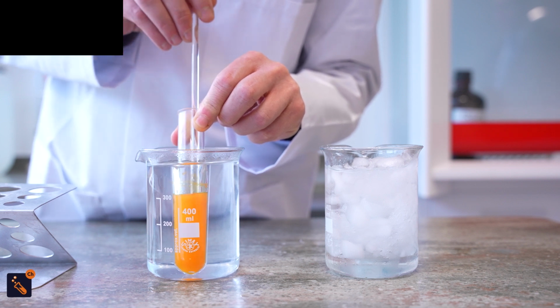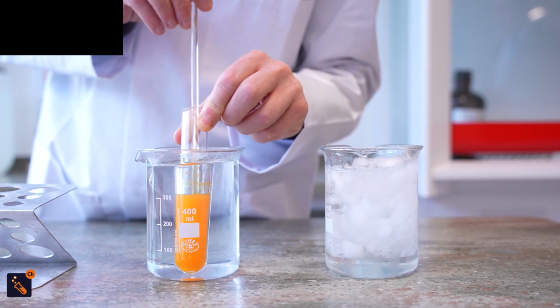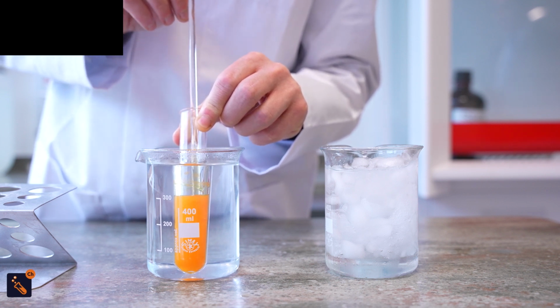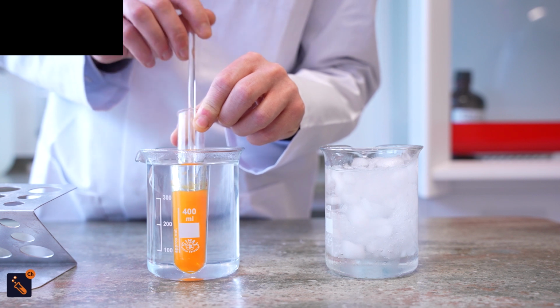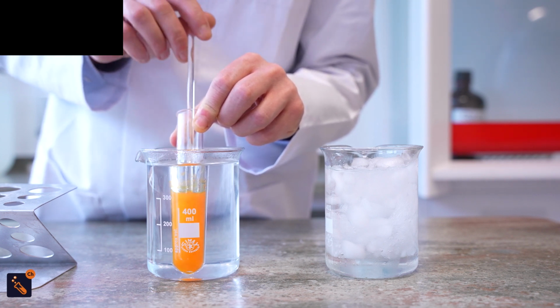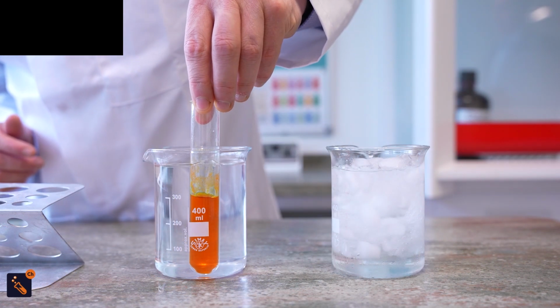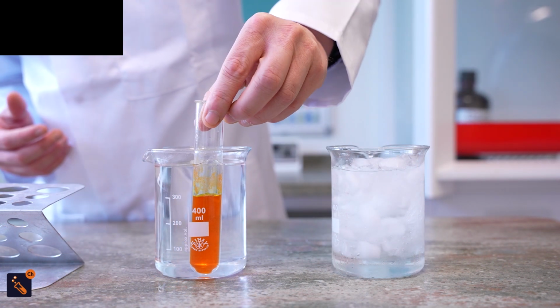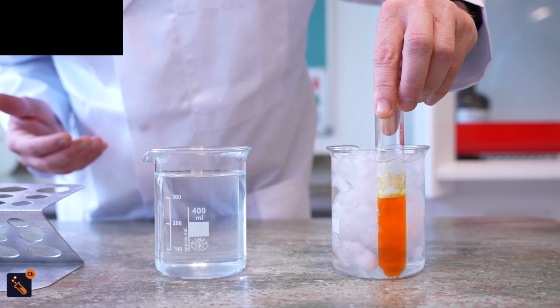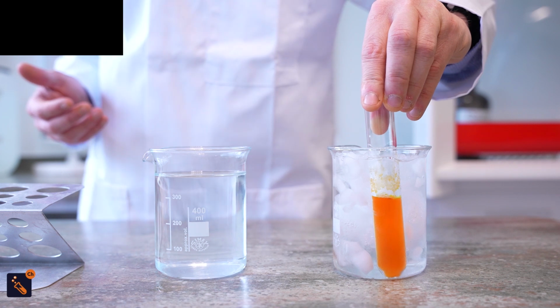As we stir it, the product will dissolve last because it doesn't dissolve very well in the solvent, but the impurities will dissolve really, really quickly. Now you can see that it's fully dissolved because of this hot solvent. All we have to do now is put it straight into the ice bath. This should happen almost straight away.